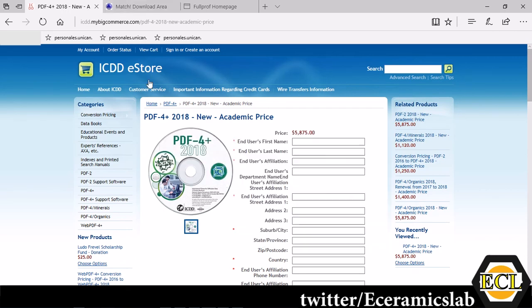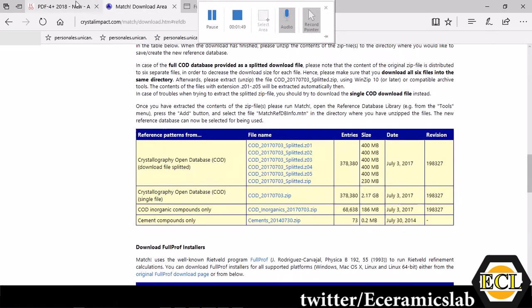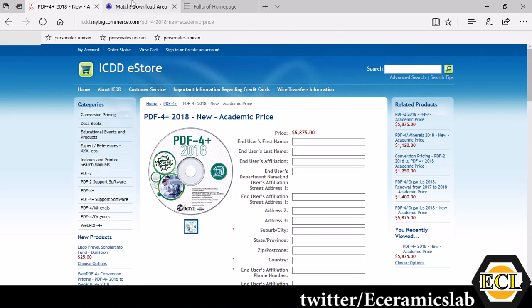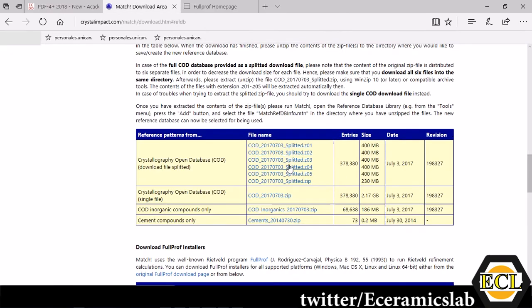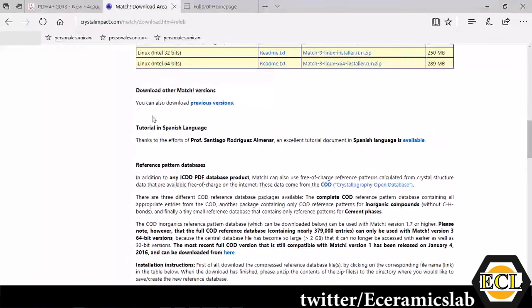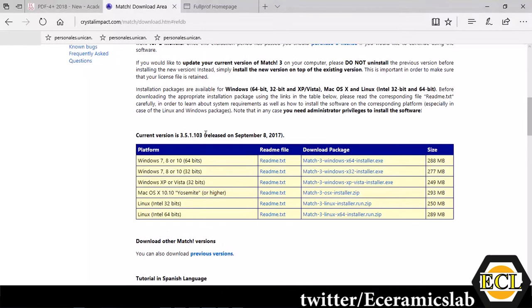If you have these two databases, PDF4 which can be obtained from International Center for Diffraction Data website or you can have a Crystal Open Database. These two databases you can feed into your MATCH software and then you can use it for indexing your peaks or matching your diffraction pattern. These are the prerequisites to have.